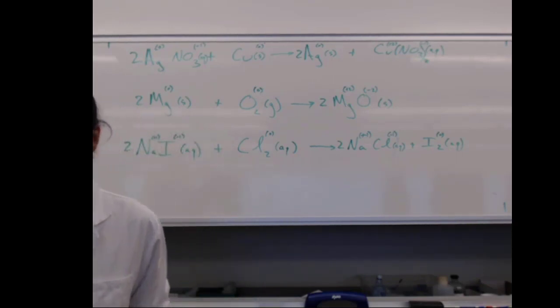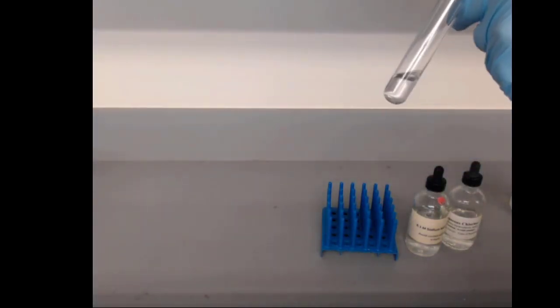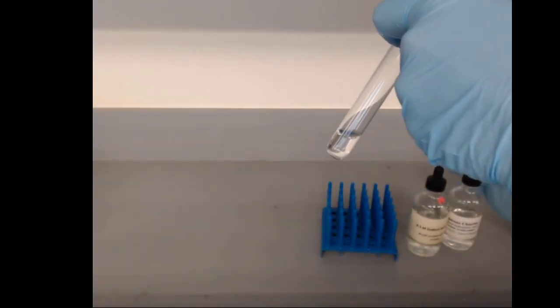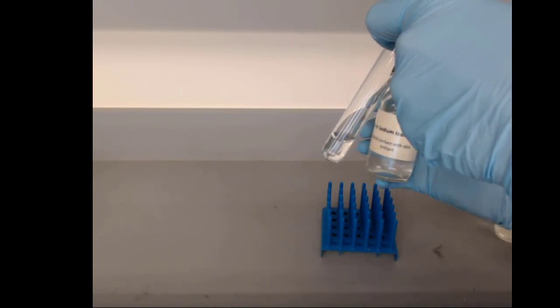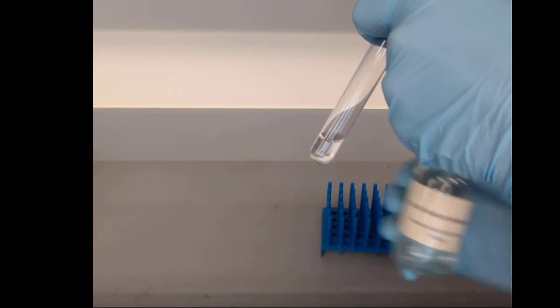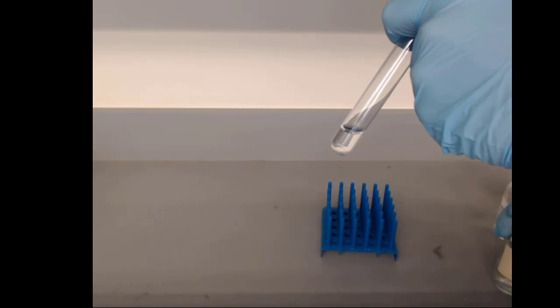Let's look at these reactions too. Let's go ahead and take a look at those redox reactions we just wrote down. So here is the aqueous chlorine solution. It doesn't look like much, but it does have that faint pool smell to it. And to that, we're going to add our sodium iodide aqueous solution, just a 0.1 molar, so that's the concentration of sodium iodide in here. And we should expect to see some chemical reaction.